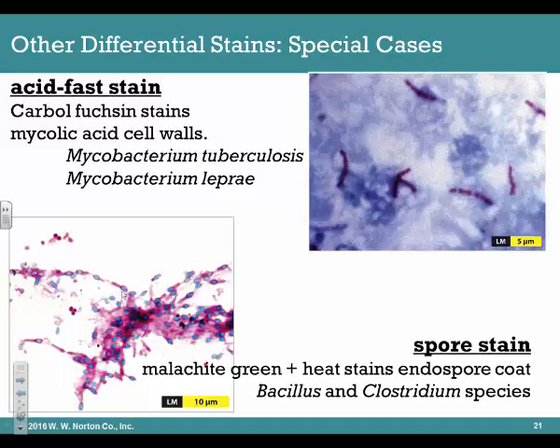And the pink color around them is the cell that is producing the spores. Some of them have a lot of pink around them and the mother cell is still intact, but some of them are just the spore by itself, and the mother cell, once it forms a spore, will die. Those are just dormant spores, and they no longer have the mother cell surrounding them.